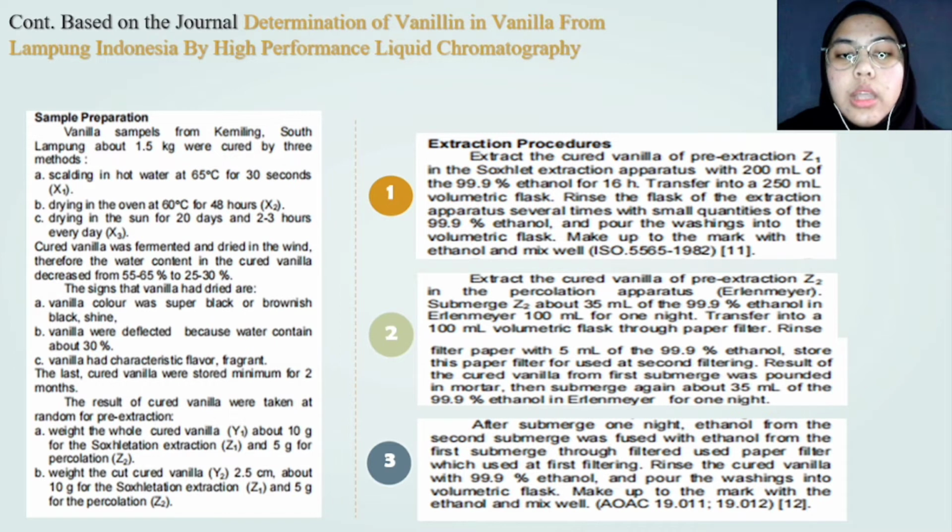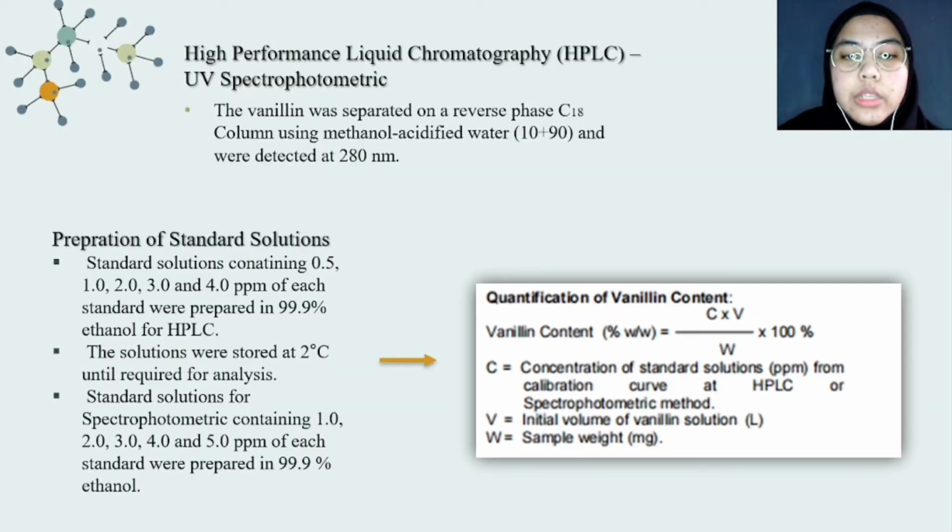Then, for extraction, the procedure was divided into 3 major steps. The steps can be read in the shown diagram. In addition, the proportion of standard solution and the vanillin content can be calculated using the formula given in the diagram.